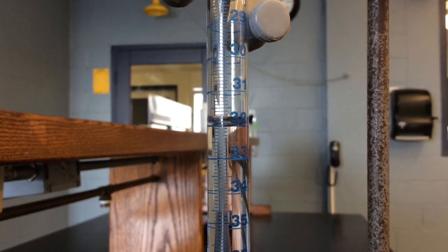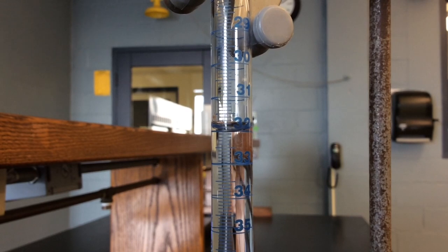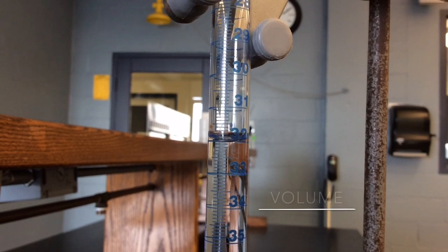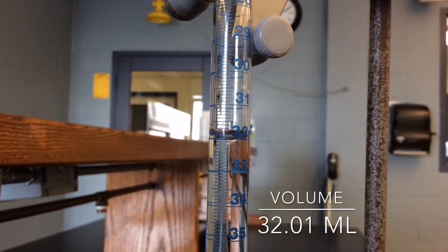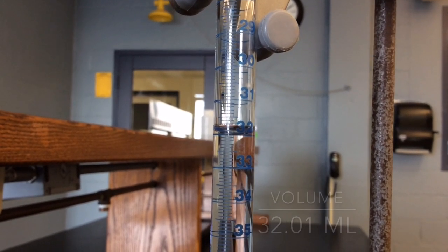The bottom of the meniscus appears to be just below the 32 line, but clearly not all the way to the 32.1 line. In my interpretation, the volume of this burette is 32.01 milliliters, but if you felt that the volume was 32.00 milliliters, you would also be correct because the error lies in the last decimal place.